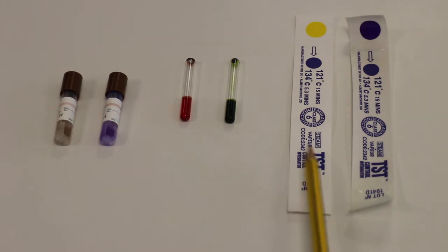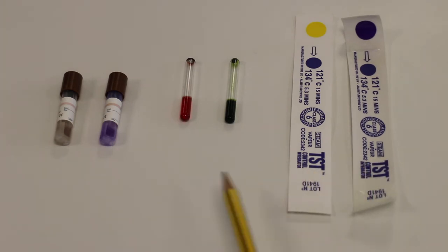Okay, so here we have the two chemical indicators, the browns tubes and the paper strips.